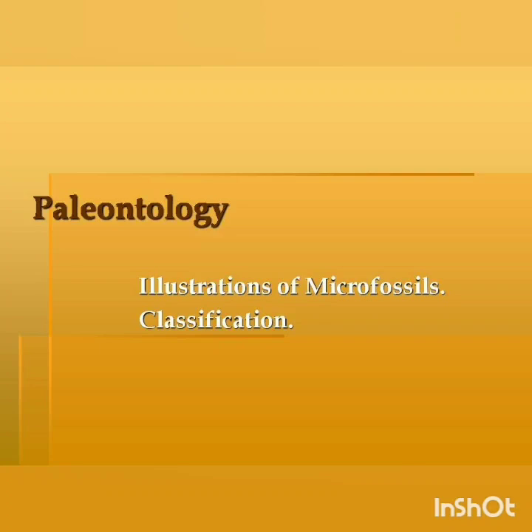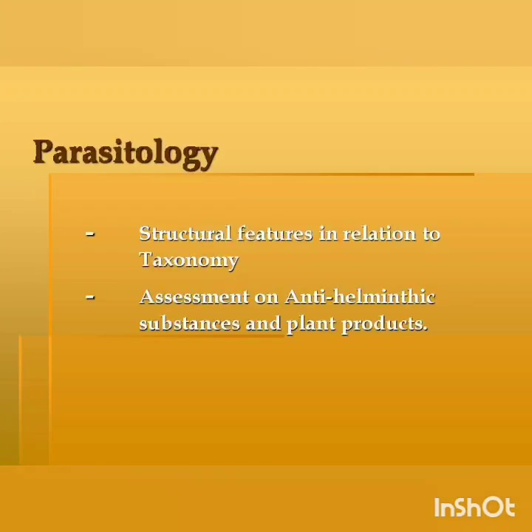In paleontology, illustrations of microfossils and classifications of fossils can be done with electron microscopy. In parasitology, structural features in relation to taxonomy, assessment of anti-helminthic substances and plant products can be studied with electron microscopy.